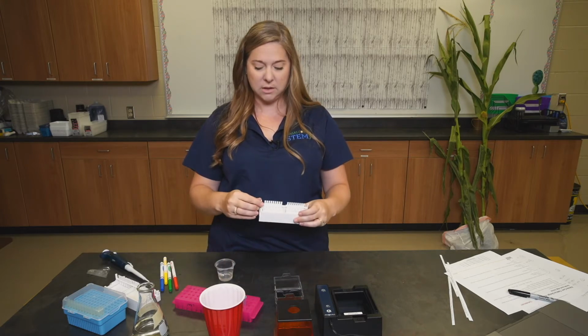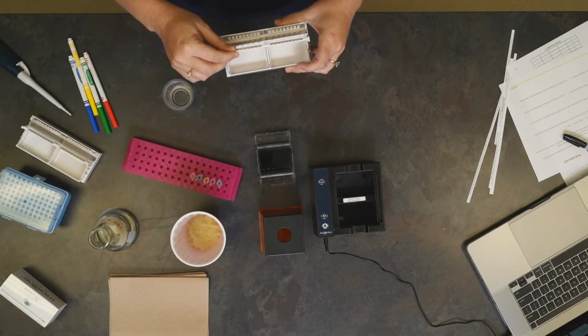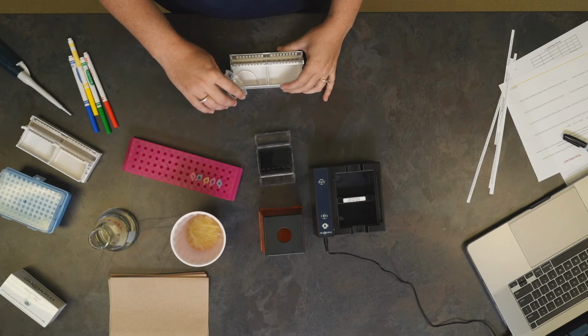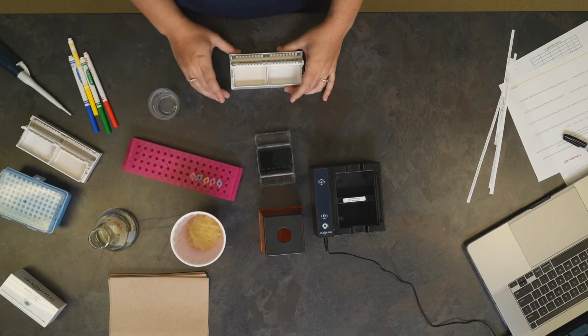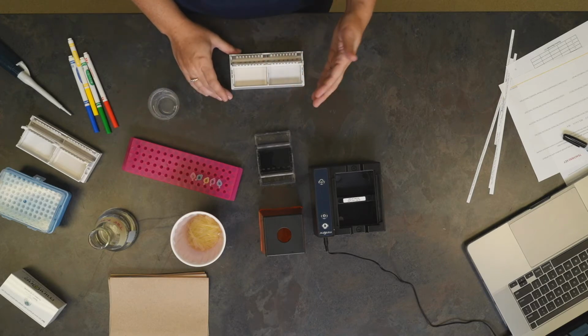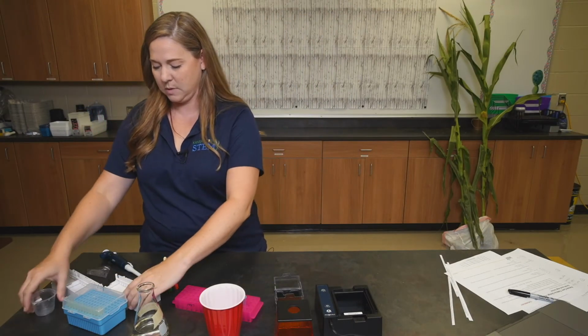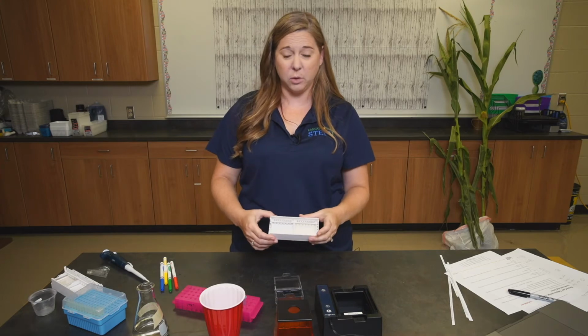Make sure your comb is in the right position with the larger well down and pour it straight in. In about 10 minutes, this will be completely set up and allow you to be able to put your gel in place. Here's one that I've completed for you.